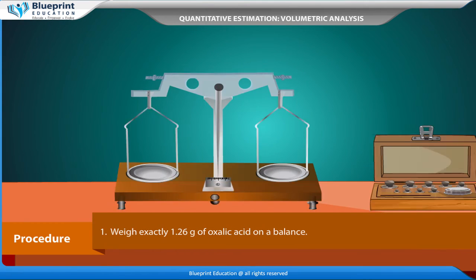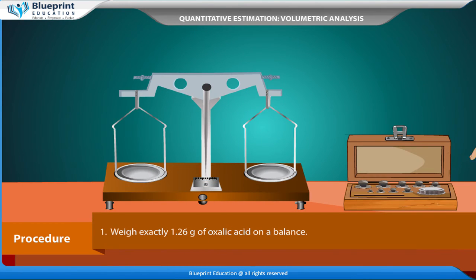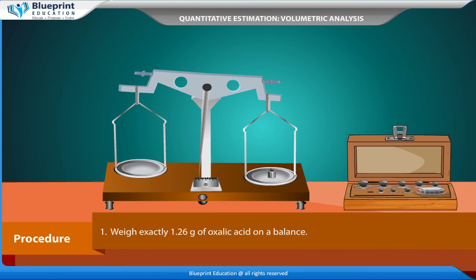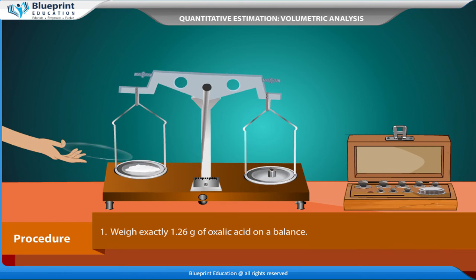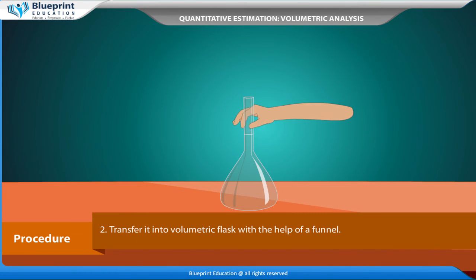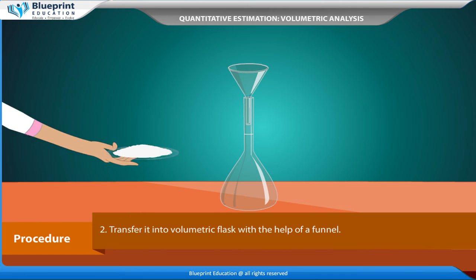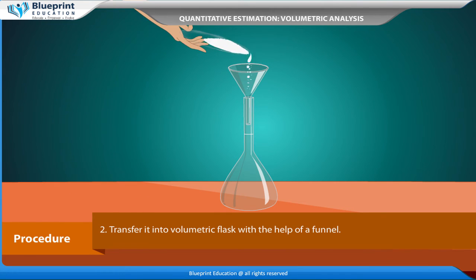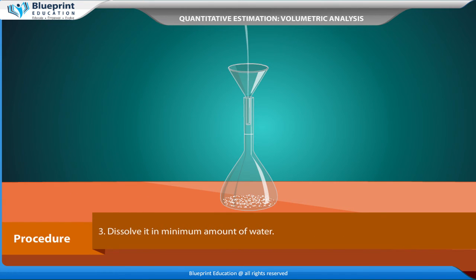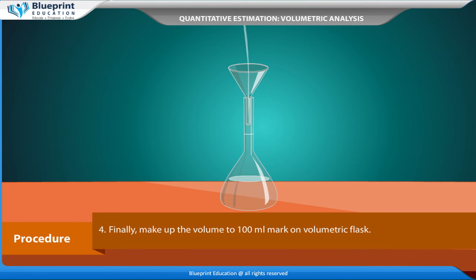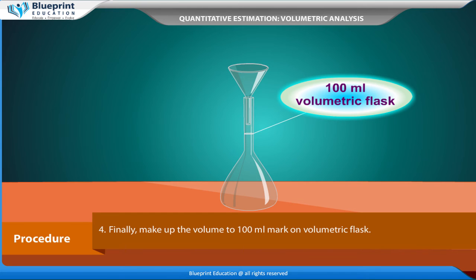Procedure: Weigh exactly 1.26 grams of oxalic acid on a balance. Transfer it into a volumetric flask with the help of a funnel. Dissolve it in a minimum amount of water. Finally, make up the volume to the 100 ml mark on the volumetric flask.